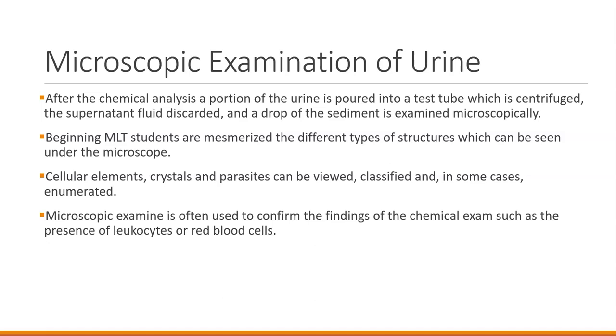The beginning MLT students are mesmerized by the different types of structures which can be seen under the microscope. I've learned to set a timer for them, or have them set a timer, because after a while the coverslip specimen will start to dry out, and that will cause additional structures to appear which are in no way related to the original sediment. Cellular elements, crystals, and parasites can be viewed, classified, and in some cases enumerated or counted.